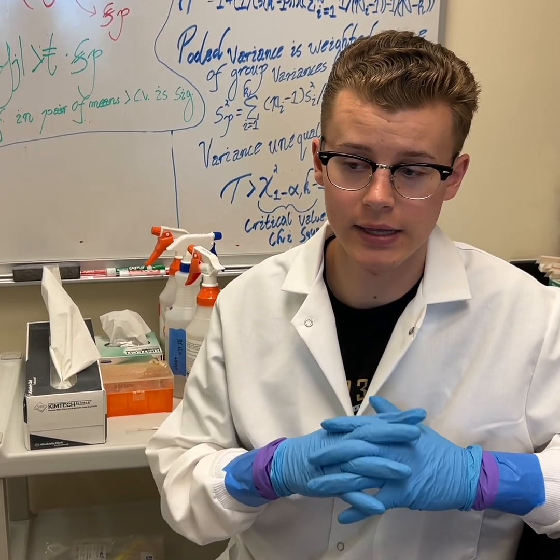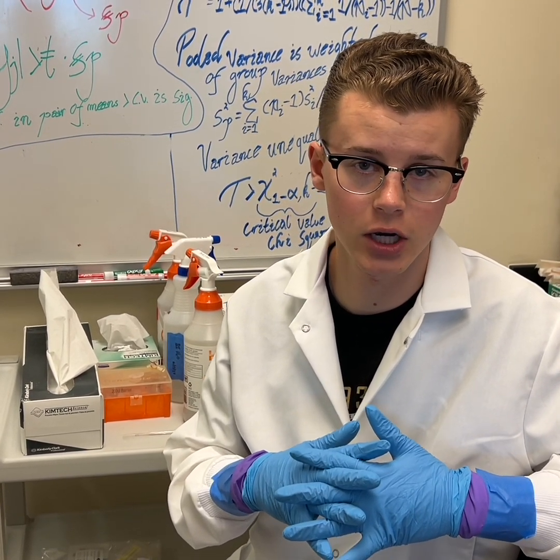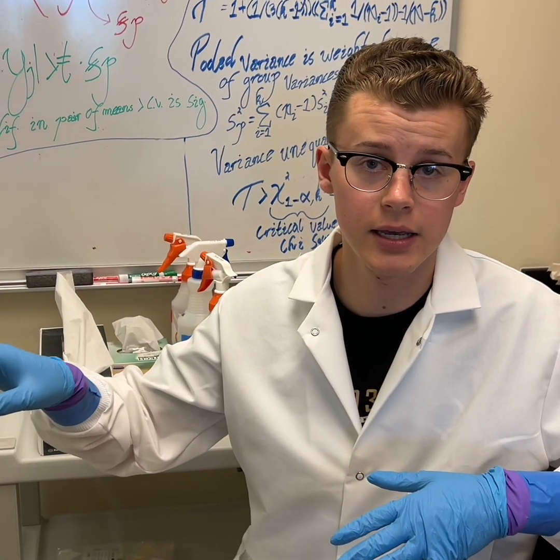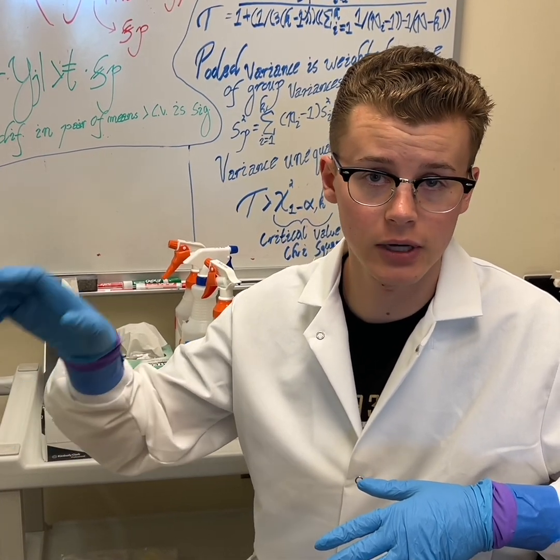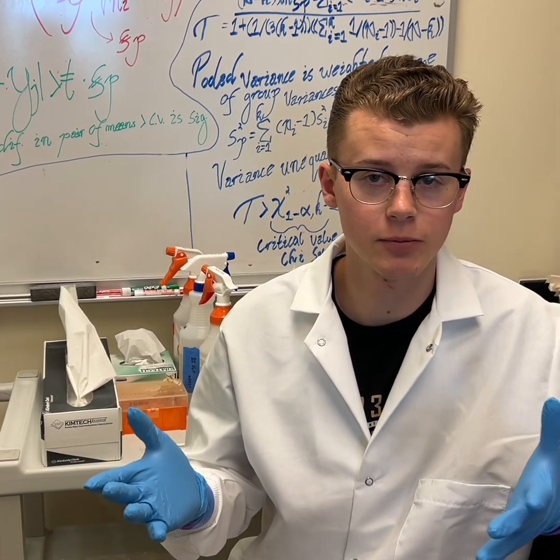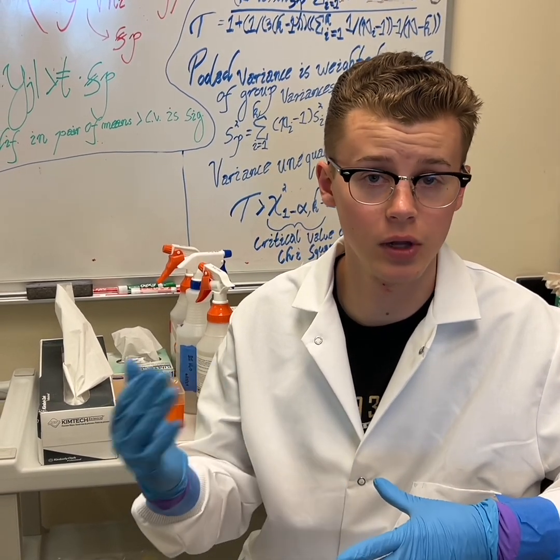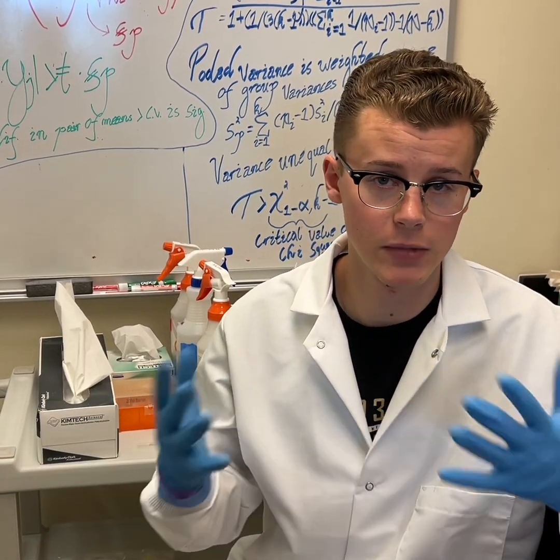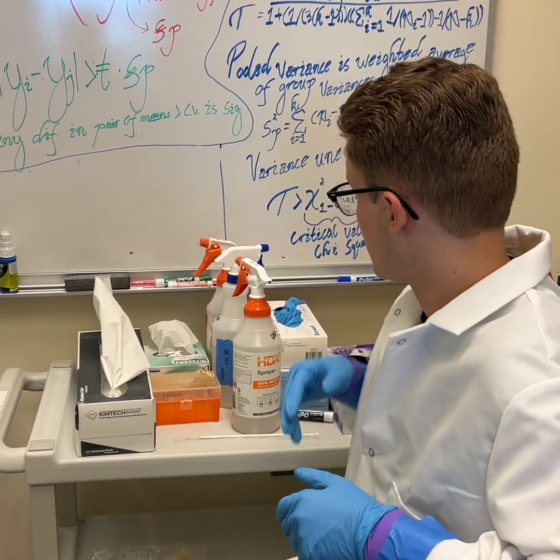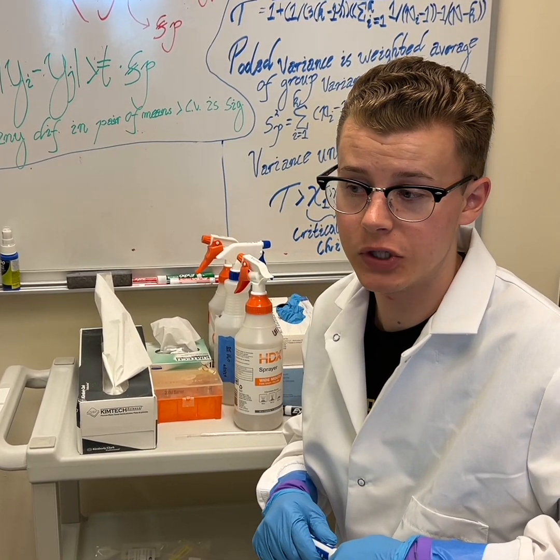We've found that with enhanced BSL2 precautions, this step can take a very long time if you're washing 3 times, because standard XTTs will have you flick the supernatant out and then slap it onto some towels. But obviously that's not an option for BSL-2 due to the aerosol risk. And so what we'll do is we'll be using a pipette to pull up, dispense into bleach, and then add some more.